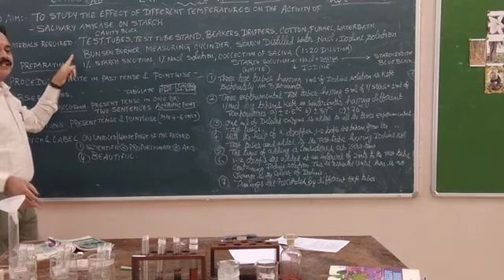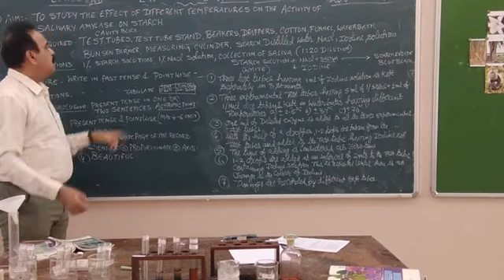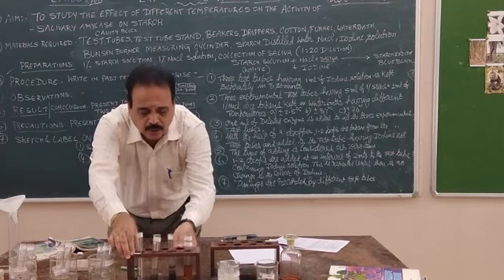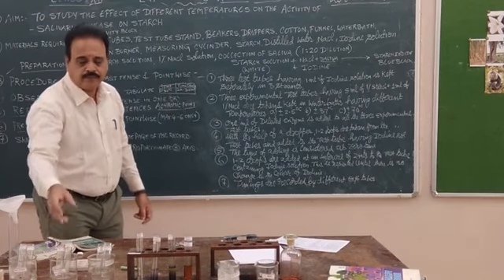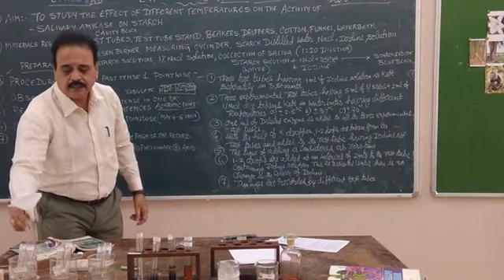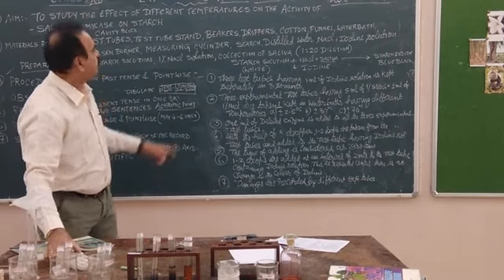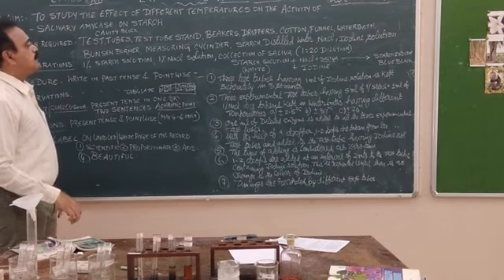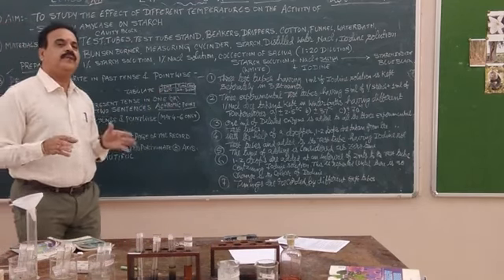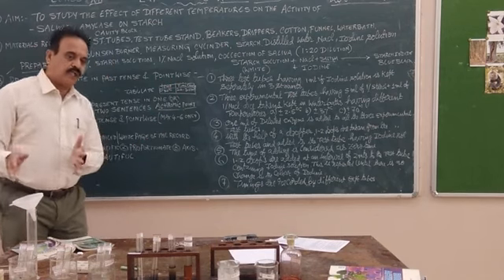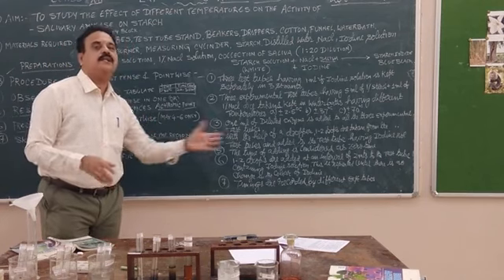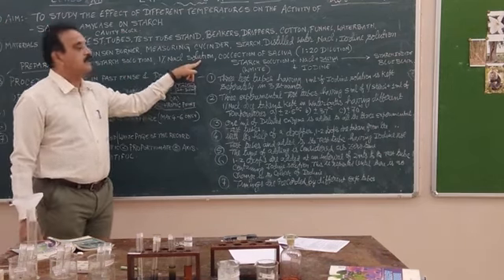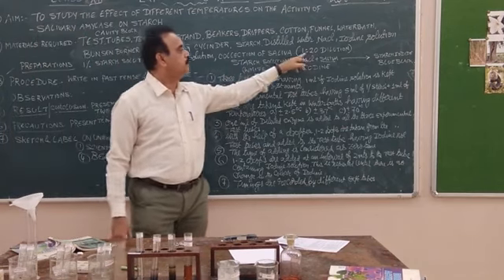Second, materials required. To perform this experiment we need: test tubes, a test tube stand, test tube holders, beakers, a flask, a measuring cylinder, cotton, and of course we have taken chemicals from the lab — this is called a cavity block, used for this experiment. The chemicals we require: we need to prepare solutions beforehand. We prepared all the solutions yesterday. The solutions are: 1% starch solution, 1% NaCl solution, and of course saliva — diluted in the ratio of 1:2.